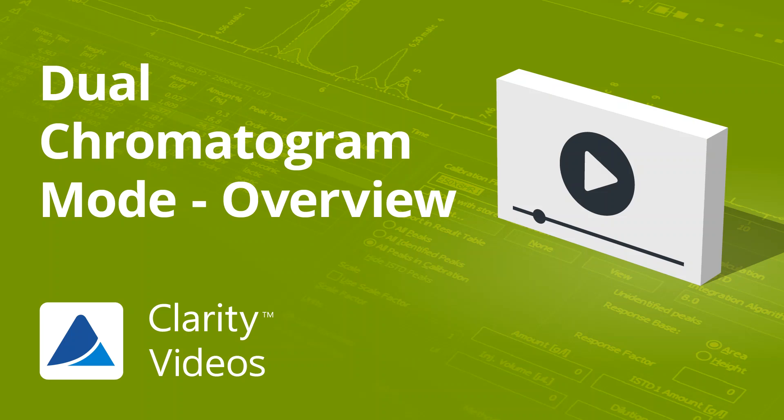Hello, in this video, I will introduce you to the Dual Chromatogram mode in Clarity.